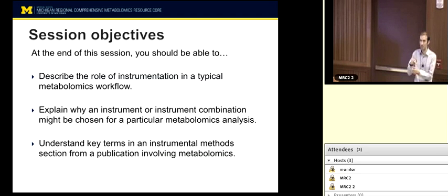We don't want something that's going to be analogous to a plate reader assay where we have to do a different manipulation for each sample. We want to be able to look at many things at once. And so the instrumental techniques which enable that, by and large, for metabolomics purposes, are LCMS, liquid chromatography mass spectrometry, GCMS, gas chromatography mass spec, and then NMR.